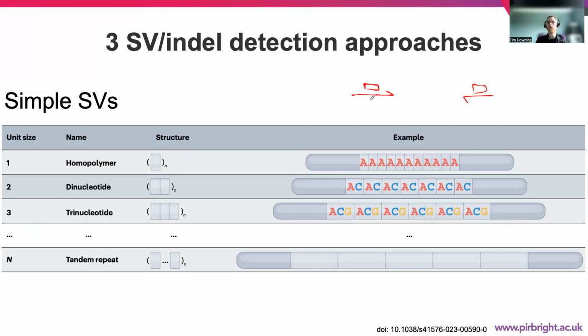And then if we're dealing with a repeat where its length is longer than a single read, that means it's more difficult to resolve because we're looking at multiple reads to get a consensus of that information. And if indeed we're looking at a structural variant whose total length exceeds that of the vast majority of our reads, then it is more tricky because we'll have patterns.